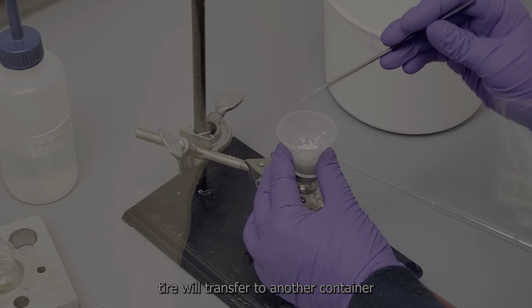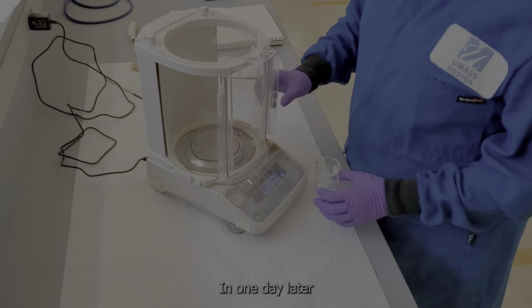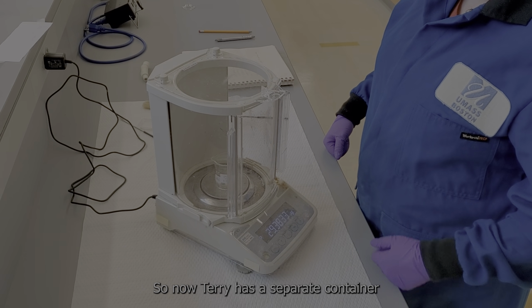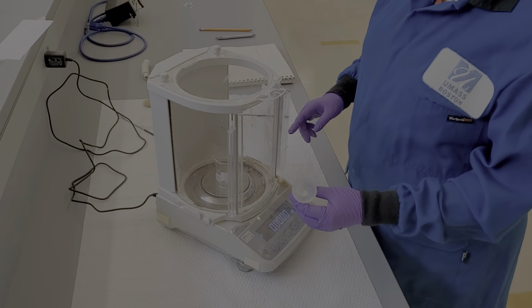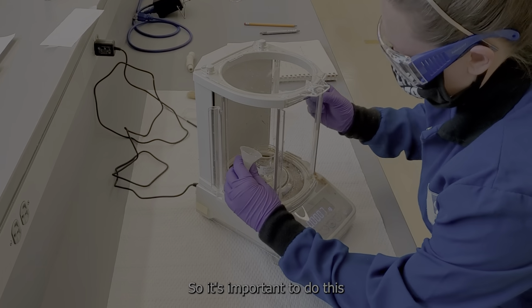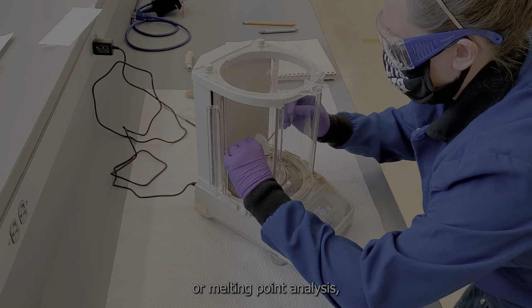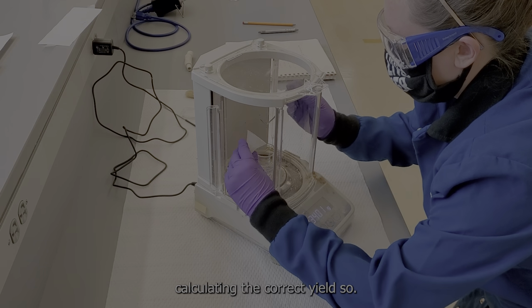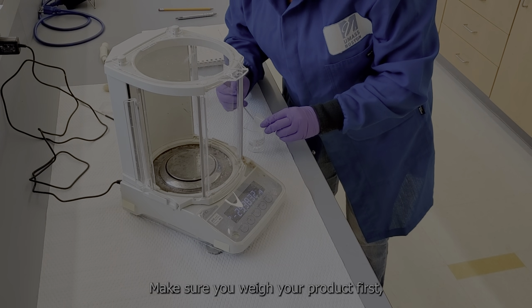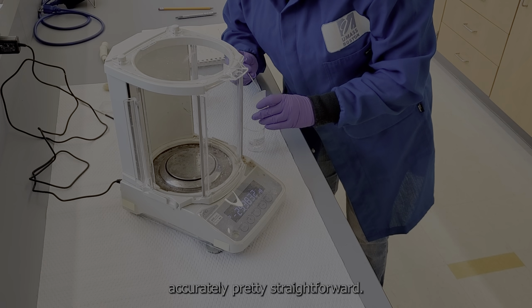Once done filtering, Tara will transfer to another container and allow it to dry overnight. Then one day later, the product is fully dried. So now Tara has a separate container where she's going to weigh it and transfer the sample. It's important to do this first before doing any of the IR or melting point analysis, because you want to ensure that you're calculating the correct yield. So make sure you weigh your product first so you can determine your yield accurately. Pretty straightforward.